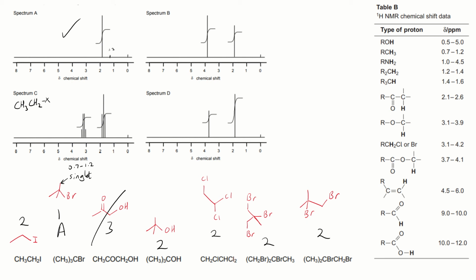So what I'm looking for is the CH3-CH2 little chain. As we can see right at the start here, CH3-CH2. Check the others to make sure. CH3C. Here we've got a CH2CH, CH2C, CH3C. So this is the only one that matches. So as I was just saying before, this would be the triplet. This would be the quartet.